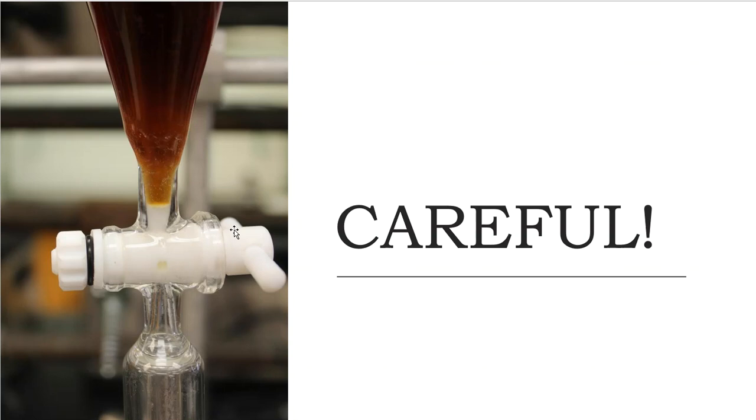So if you notice, I've got the stopcock closed, and then I'm going to give this a couple of very quick flicks. I'm going to grab the stopcock and just flick it, and only allow one or two drops at a time to come through at this point.